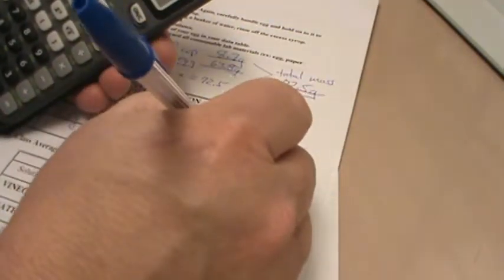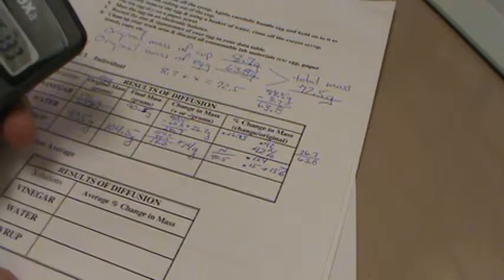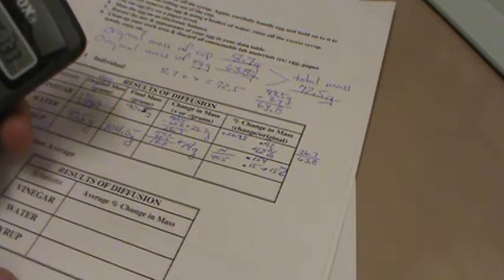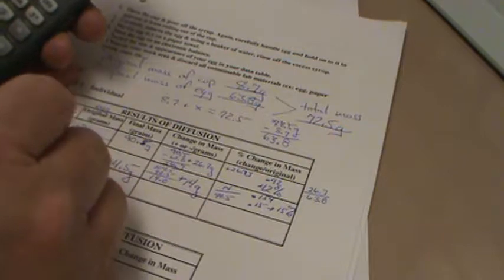I know we could run it out further, but we're just going to leave it right here. So that is a 0.15, or a 15% increase. And that's based on only a 5% difference in the water molecules between the vinegar and the distilled water.